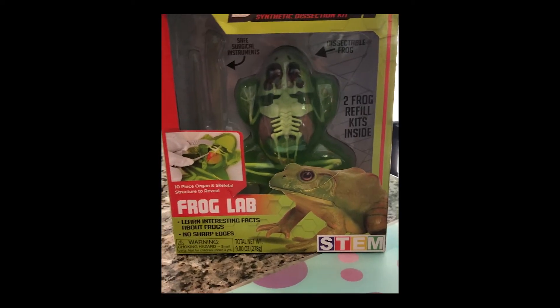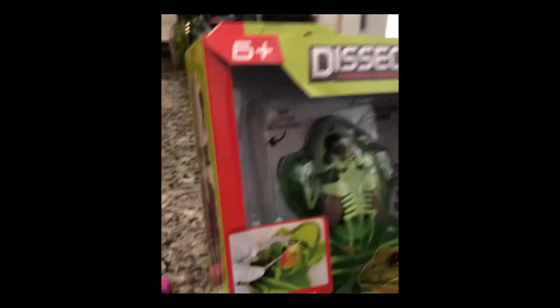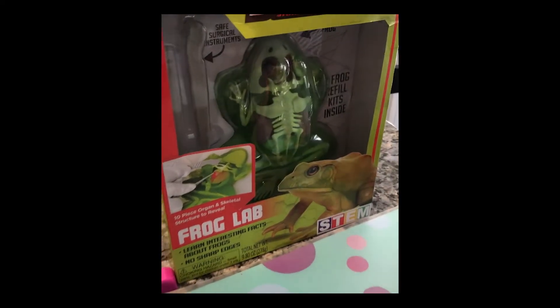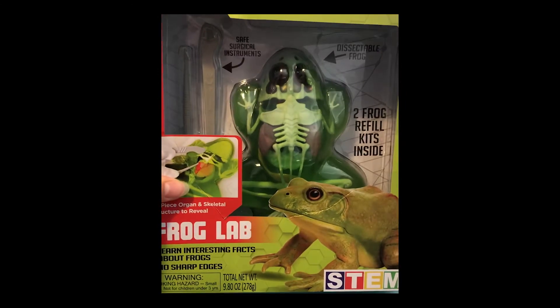Hi everybody. My mom and me are doing this frog bingo. I'm just going to put that here, and then we are going to open this box right now. So let's get started.